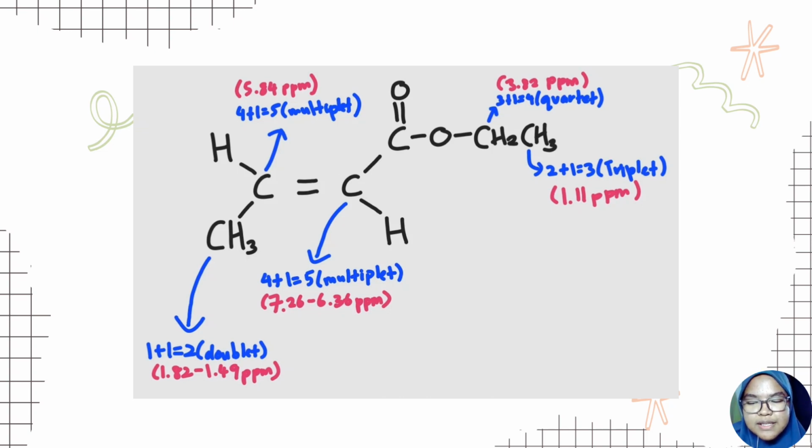It was stated at 1.82 ppm until 1.49 ppm because it was far away from any electronegative atom.